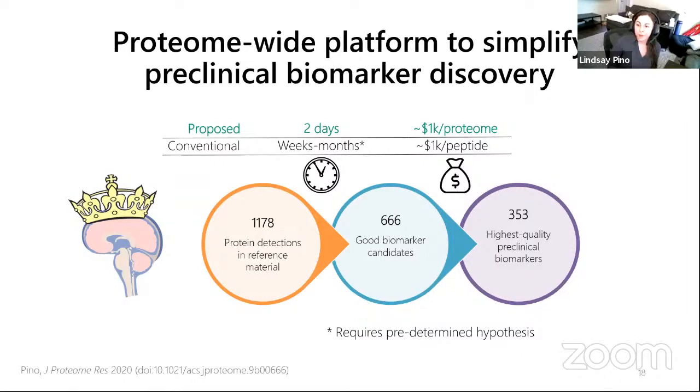Yeah, so proteomics biomarker, there's a couple good papers, and if one isn't able to get to them in the chat, the two good papers as far as biomarker validations, the first one is Andy Hoofnagle and Russ Grant. The title of it is something like Paradise Found or Paradise Lost and Found. It's about a 3-page paper, very quick read, that highlights all of the experiments you should do to get to this kind of preclinical biomarker stage. Again, that's not like a validated assay to put in patients, but it gets you to the preclinical stage.